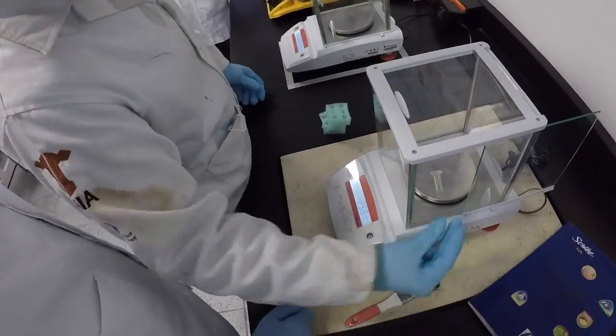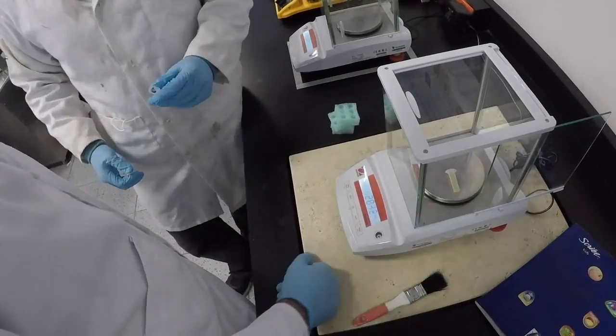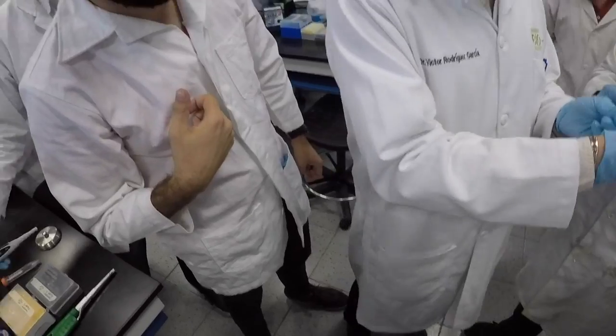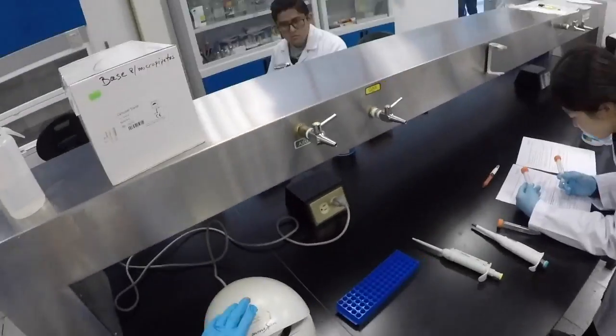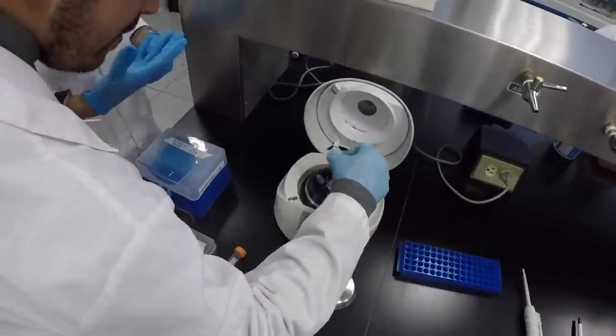The first centrifugation took place after waiting and preparing a twin tube to put inside the machine. The conditions were 4 degrees for 10 minutes at a speed of 11,600 RPM.